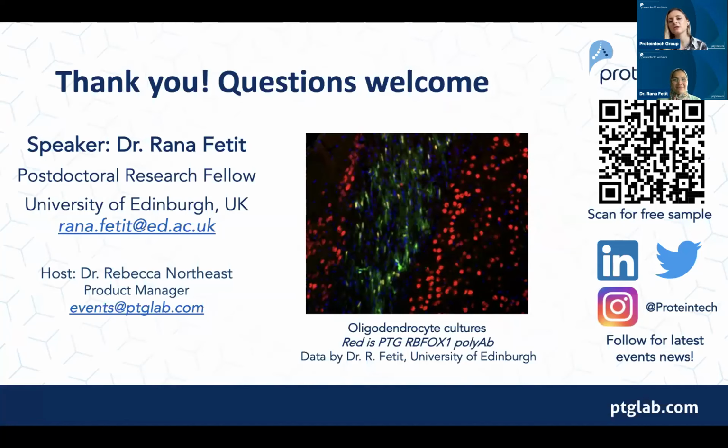Another direct differentiation question is, have you ever tried direct cellular reprogramming from somatic cells to OPCs, and do you have an opinion on this? Cellular reprogramming, you mean starting from just a regular skin cell or biopsy and then reprogramming them into iPSCs? To OPCs. Yeah, you'll probably have to reprogram them into iPSCs first and then differentiate them. I don't see why that's not feasible. It depends on your starting cell line. If you're starting with a patient biopsy, for example, and you want to investigate certain OPC function in that context, it's definitely something you can do. Once you reach the iPSC stage and your line is stable, you can definitely start differentiating them towards oligodendrocytes.